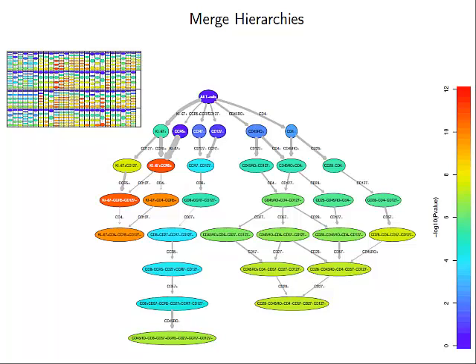Something we found a few times is the significant p-values kind of peter out after about 1, 2, 3, 4, 5 or so markers. Adding more doesn't really help you, in a couple ways. These are much more rare populations. They're using more markers, so there tend to be fewer cells in there. So they're harder to gate. And the p-values don't tend to be as high as the ones up here.